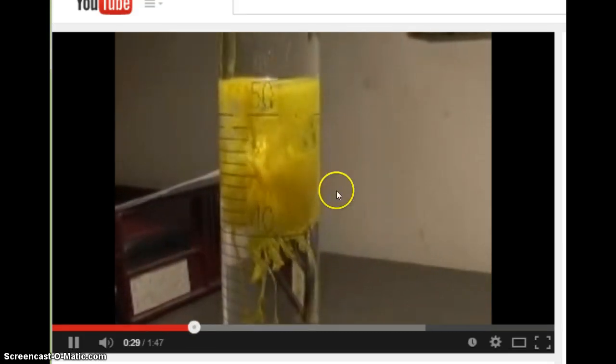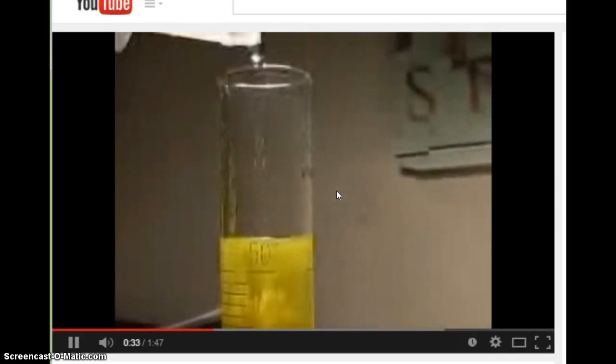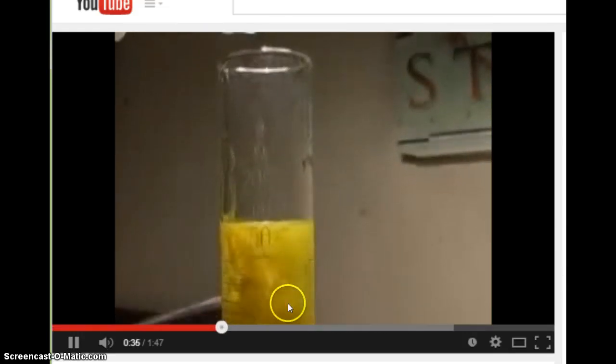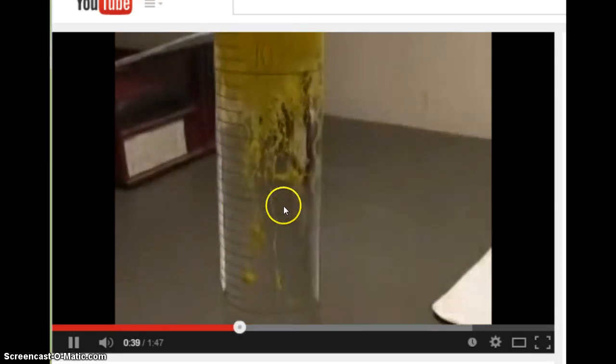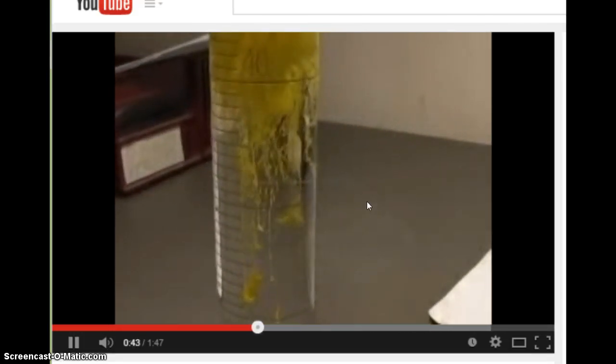A precipitate a lot of times kind of looks like magic. We put two clear liquids together, and look at what I got. Not only a distinct color change, but I have chunks of a solid. So this is an example of what a precipitate is. You put two liquids together, they have a chemical reaction, and they make chunky solids. All right.